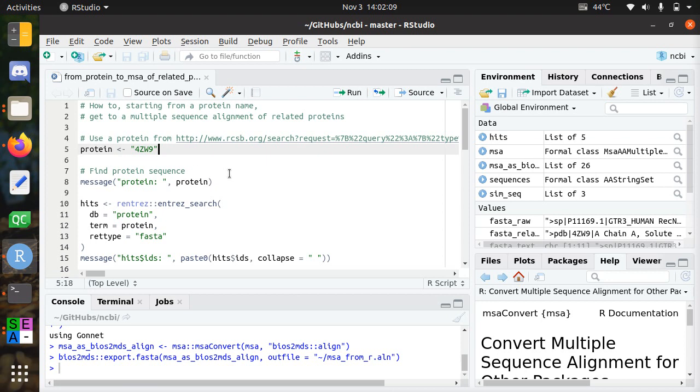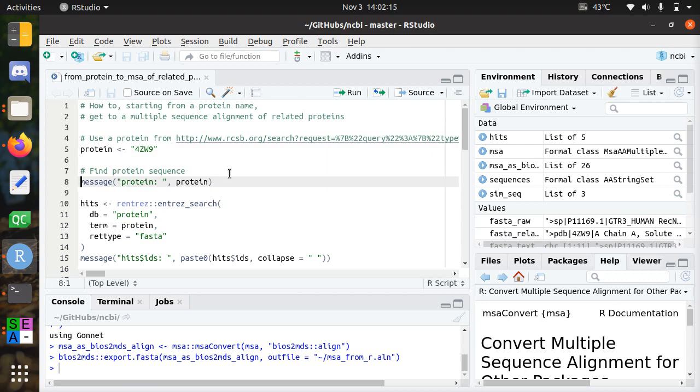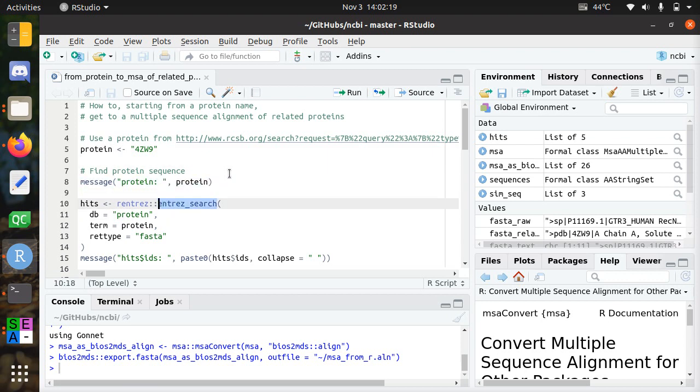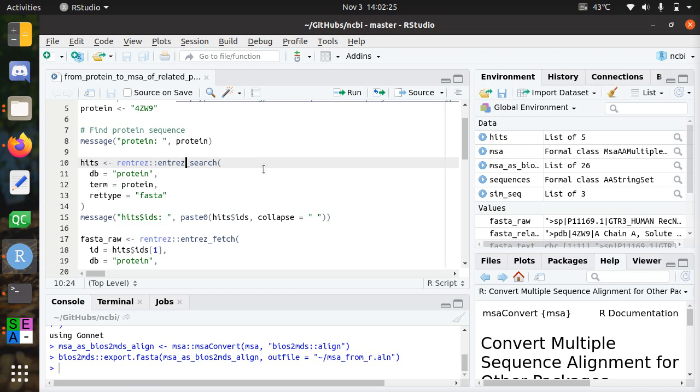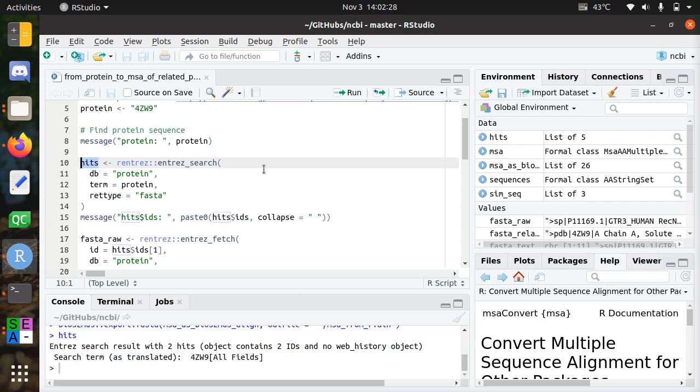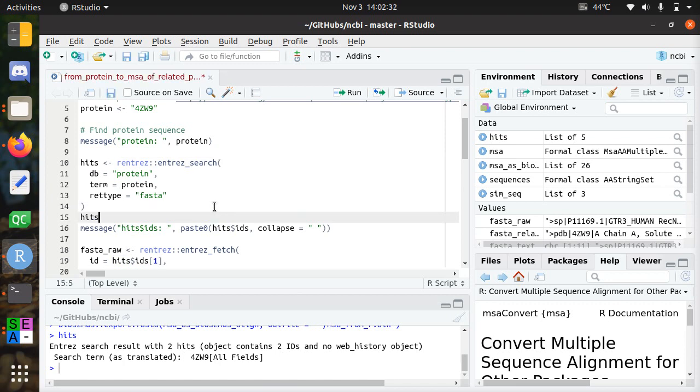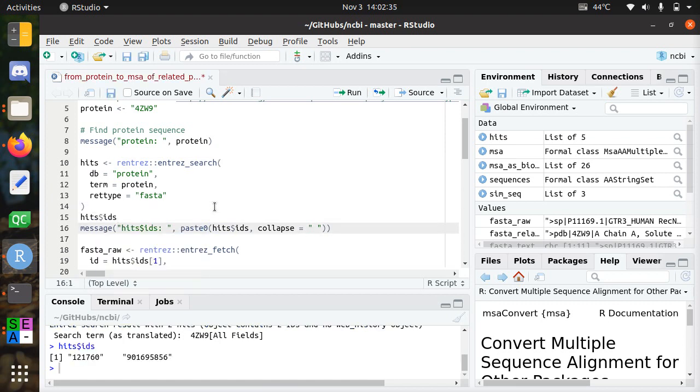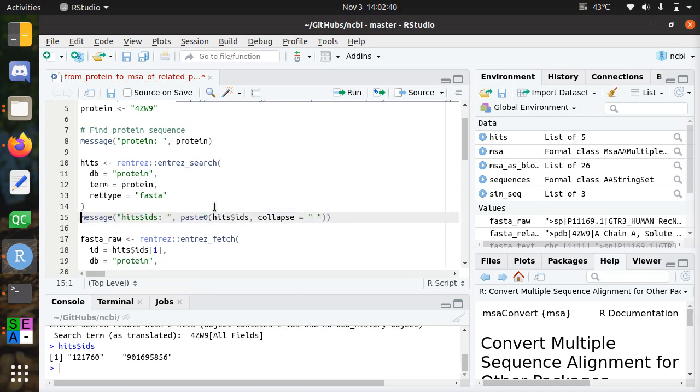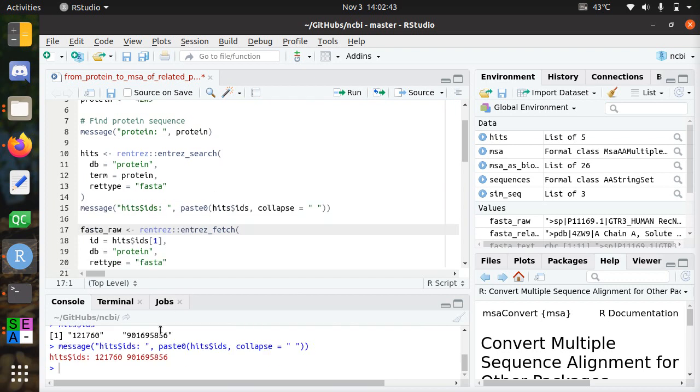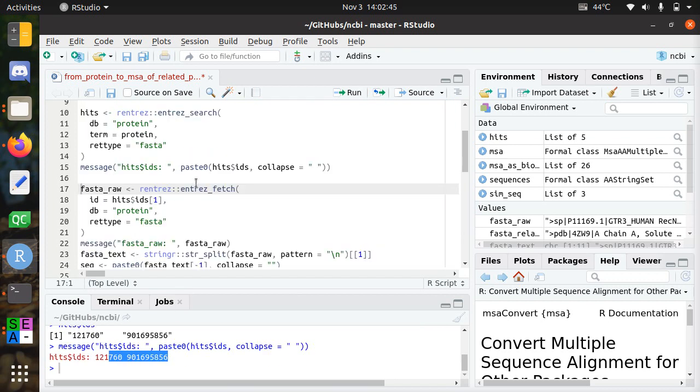To go a bit more detail into the code. So, here I set the protein name. I put it in the log. That's great. And with EntrezSearch, you look for the ID of the protein in the NCBI database. So, I got two hits. And from those hits you can get the IDs by using the IDs. And then I took the first one, which I also did in the web interface version. So, these are then the hits on screen. For in your log file. And with EntrezFetch, you get the sequences.